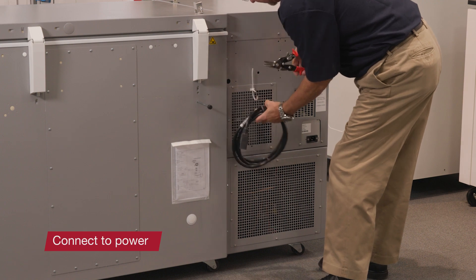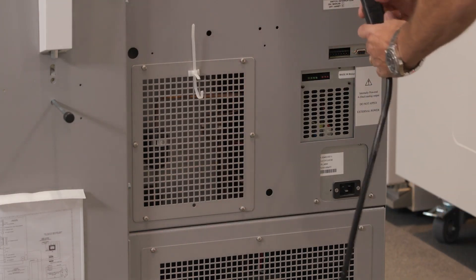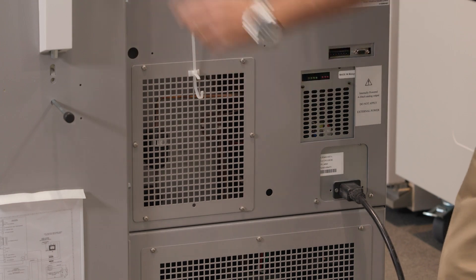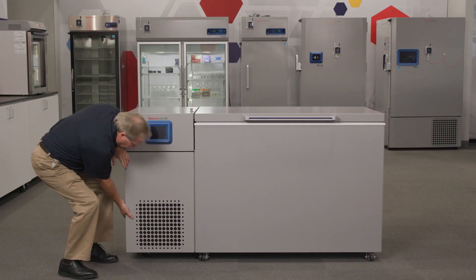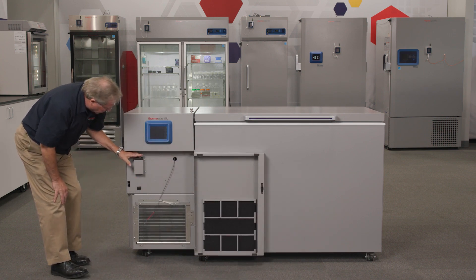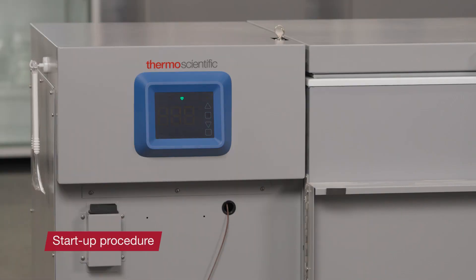To start the TDE minus 80°C chest freezer, plug the freezer into a power outlet. Turn the power switch on. You can find the switch behind the front grille on the left side. Once the freezer is turned on, the user interface will begin a startup procedure. Once ready for operation, the temperature is displayed on the screen.